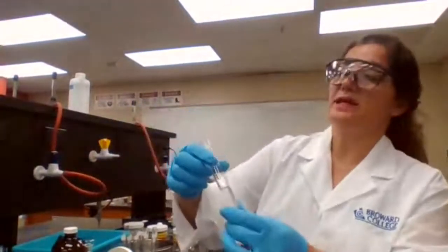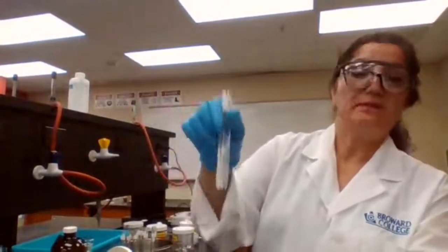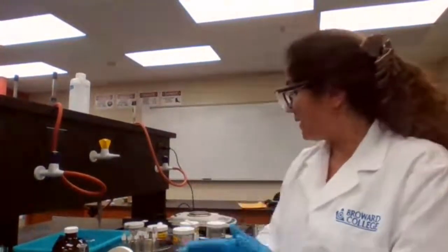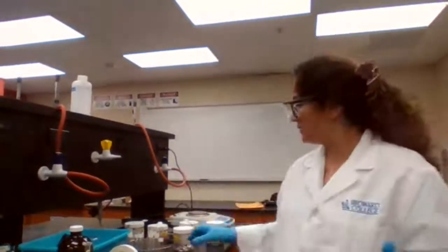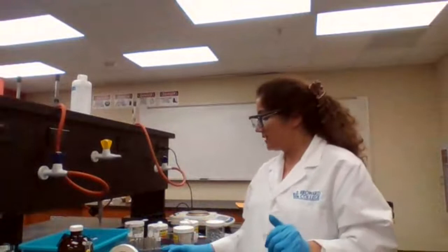The 0.2 HCl still working, and we have 1200 seconds already, 1265 seconds already. Okay, I think I have time to get the potassium permanganate at least. So I'm going to get the potassium permanganate added to the 4 test tubes.